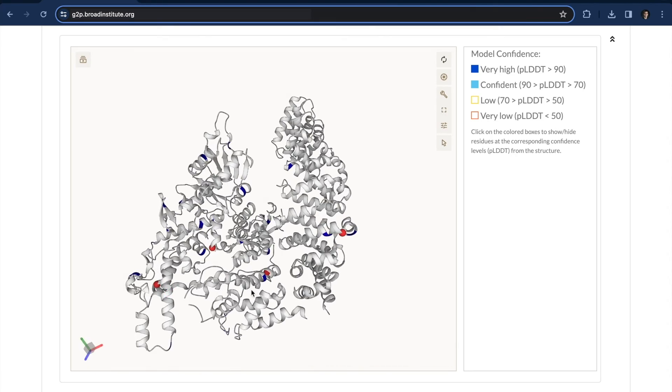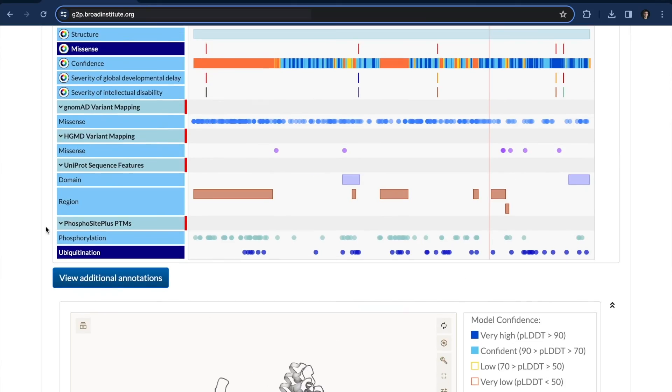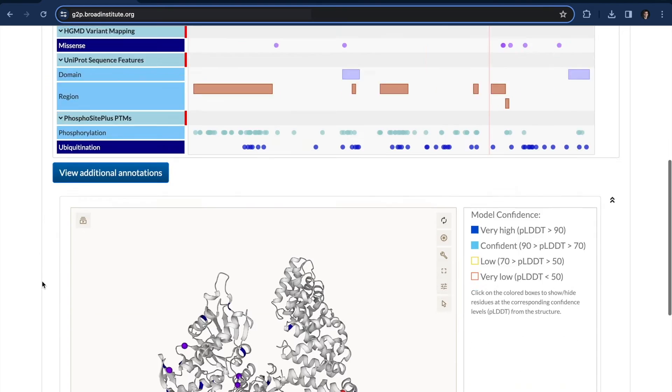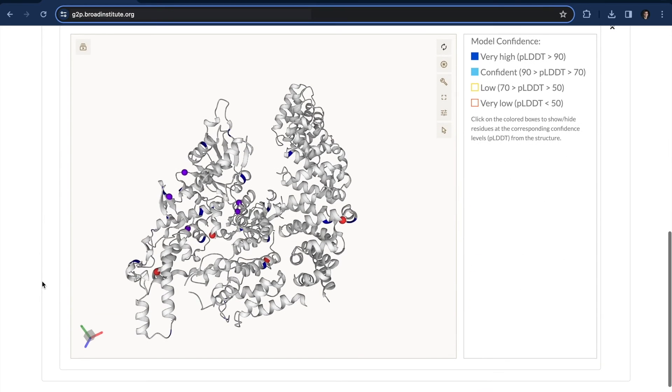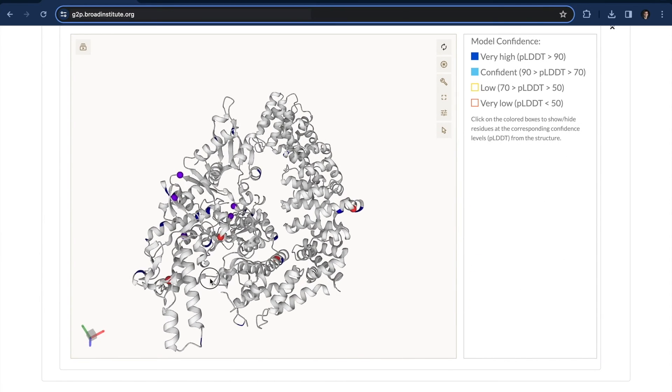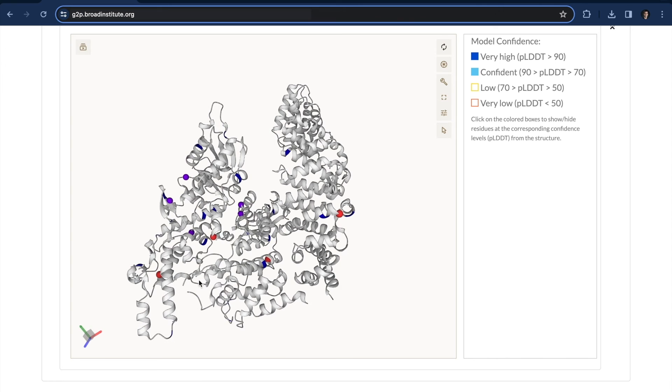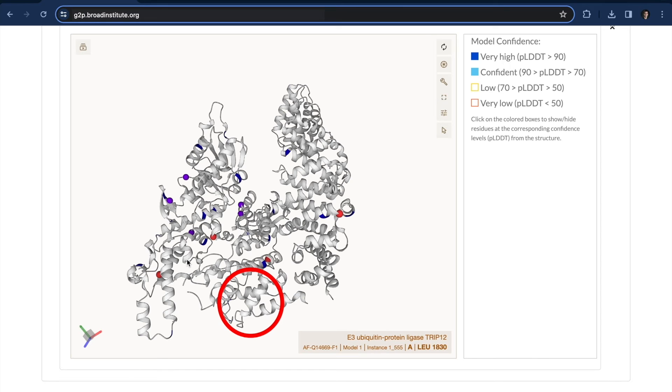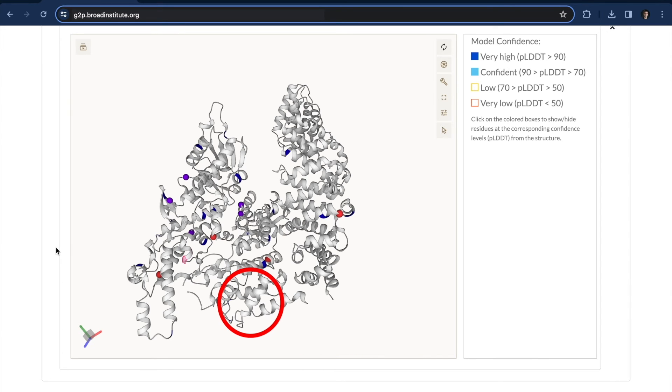And actually, if we go and add the HGMD mutations, we see that they're also close to ubiquitin sites. And then if we look at the gnomAD regions, like this region up front where we know there were a lot of gnomAD variants before, I don't see any ubiquitin sites in the whole region.